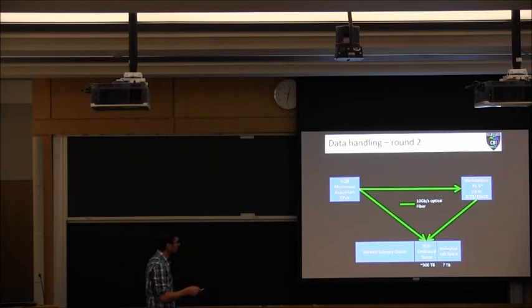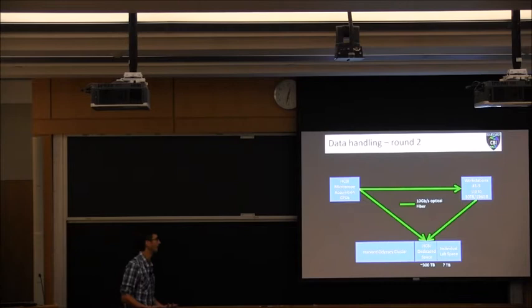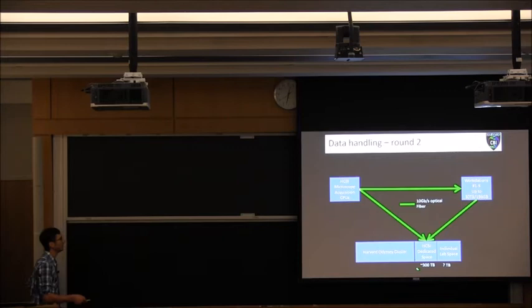And then, of course, the workstations can send data there as well. This is linked into the Harvard Odyssey cluster, so you can do processing on Odyssey by just transferring your data back and forth this way. And then most of you all have a fairly large shared space for your lab as well, somewhere on the RC network. So I don't even know how much storage space there is there in addition to all of this. But thankfully, we're at a point now where we can move the data around pretty quickly, and we have some good spots for keeping it, at least in the short to medium term. Certainly none of this is permanent storage.